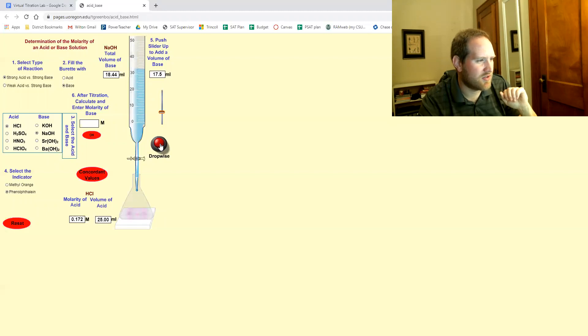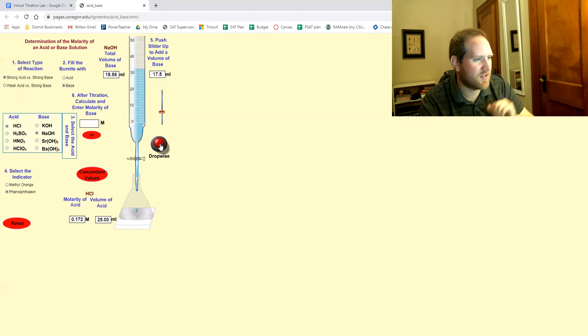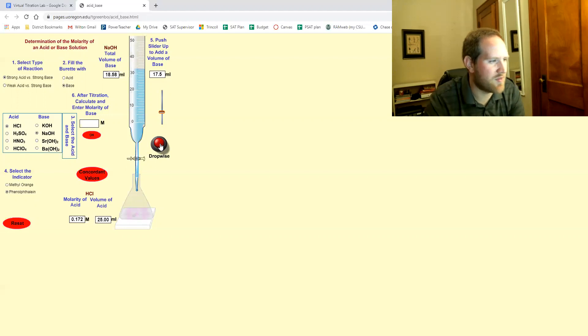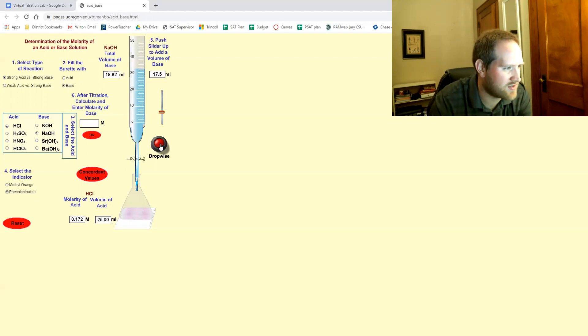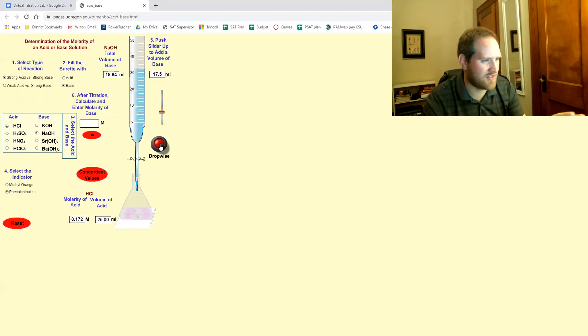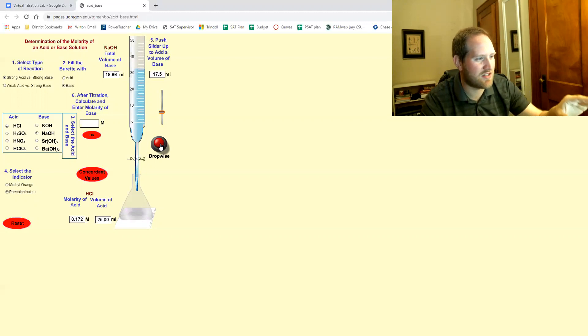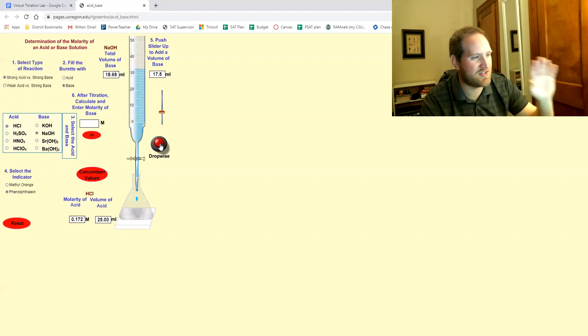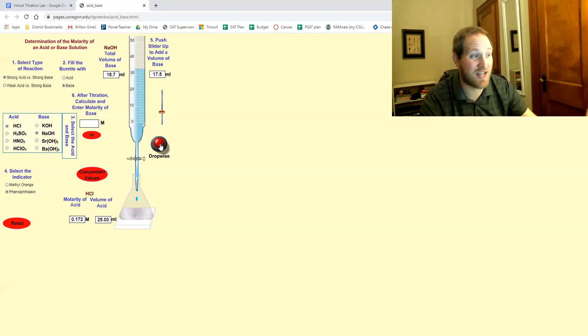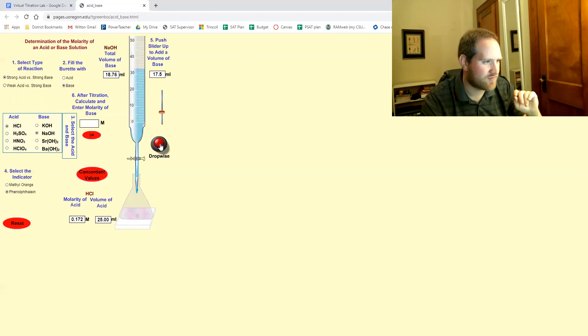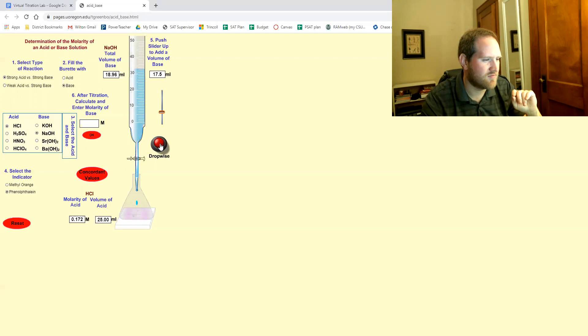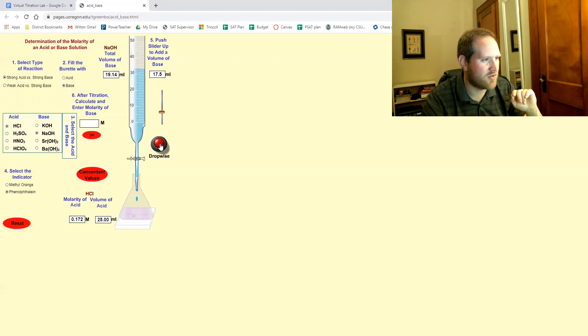All right. So again, I'm looking for the pink color to stay and I'm not going too fast. Cause it's almost like a reflex thing. Cause as soon as that drop hits it, if it stays pink, I need to stop.